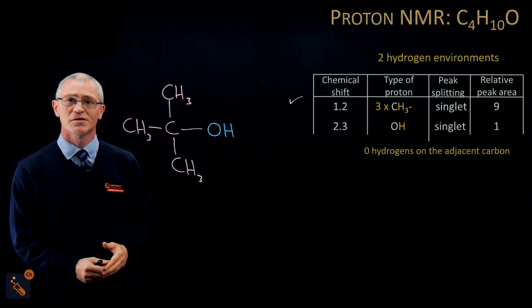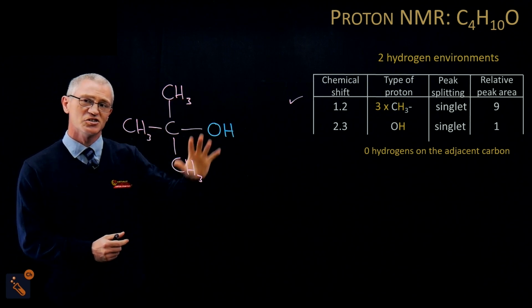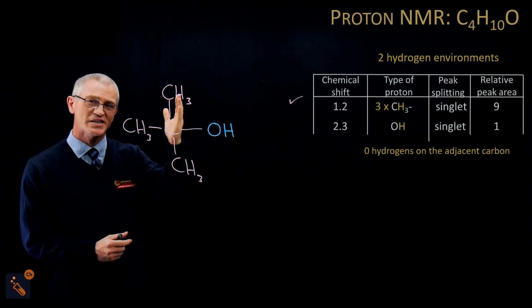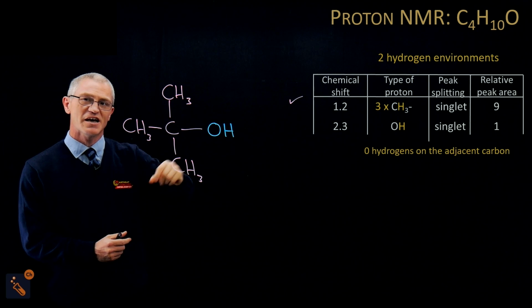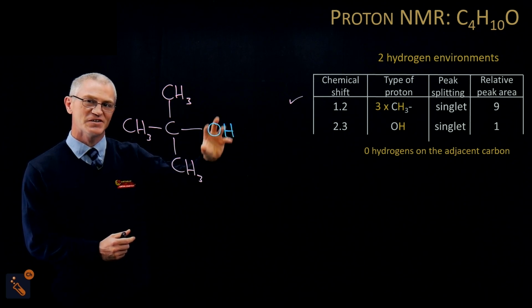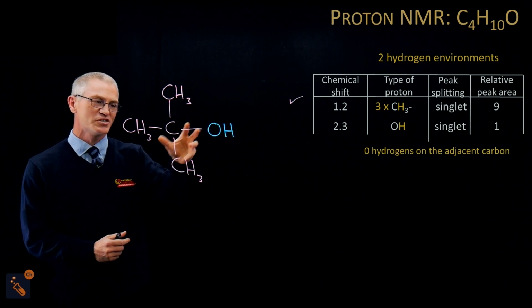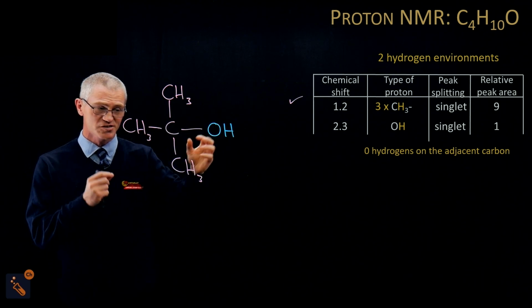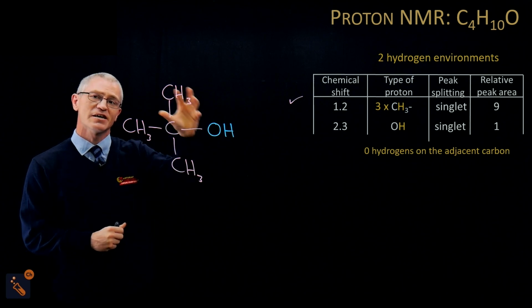So you can figure out how to make the structure as long as you take the building blocks of each part and then add them together and see how they fit together. And in the coming videos, we will take these building blocks, and we'll take many more than just 2 building blocks. We'll take 3 or 4 building blocks and say, well, how does that fit together? And that's how it fits together.